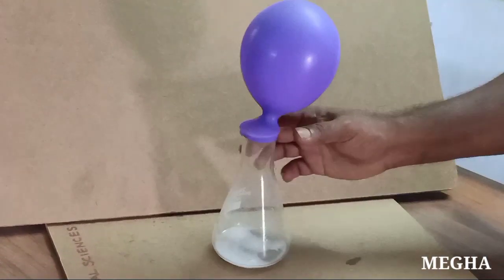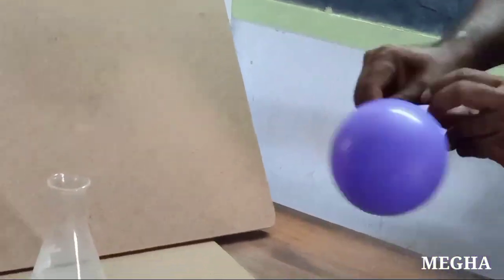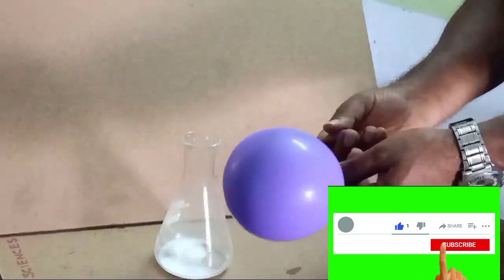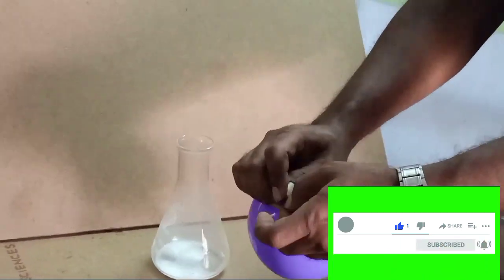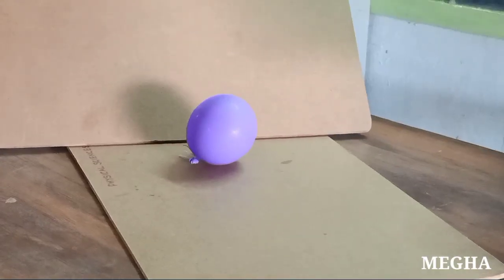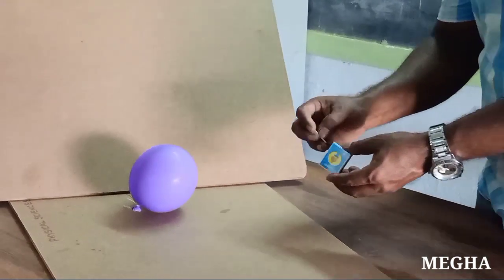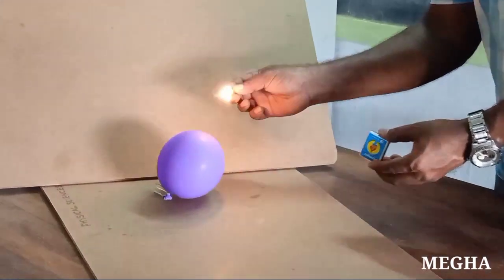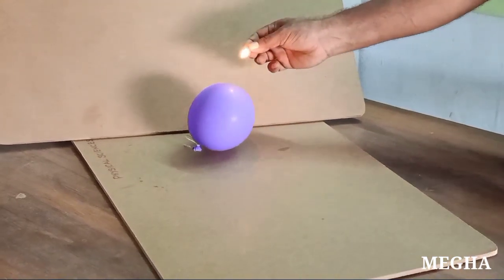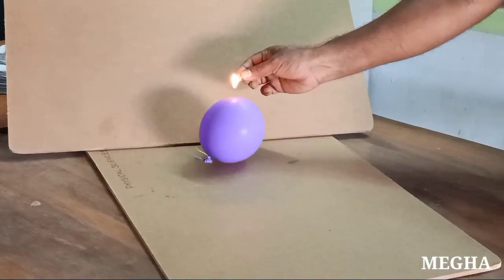Now remove the balloon, just tie it. Place it on the table. Now keep a burning matchstick near the balloon. Observe what happens.